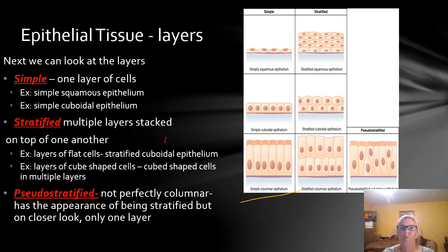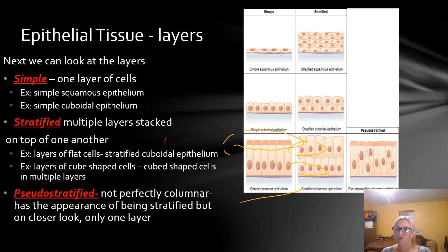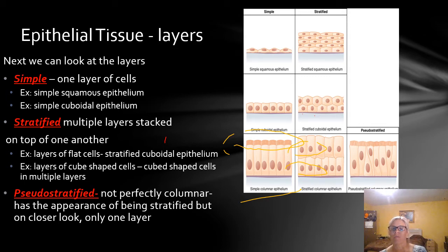In the first example here, we have simple columnar epithelium that is ciliated — it has some cilia on the top. It is definitely columnar, no question about that. Next we have stratified columnar. The nuclei don't necessarily look like they are perfectly in the middle — so that is a good example of one that kind of looks cuboidal, but is columnar. That is stratified because there are multiple layers, columnar because it is column-shaped, and epithelium because it is epithelial tissue. If it has cilia, we would want to put the word ciliated in the name.